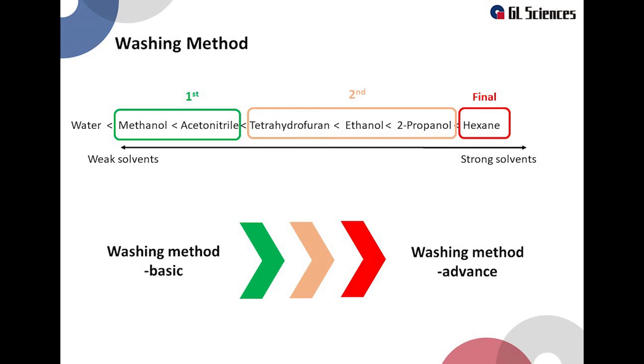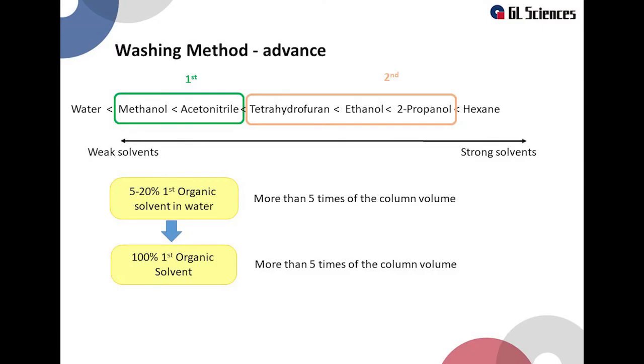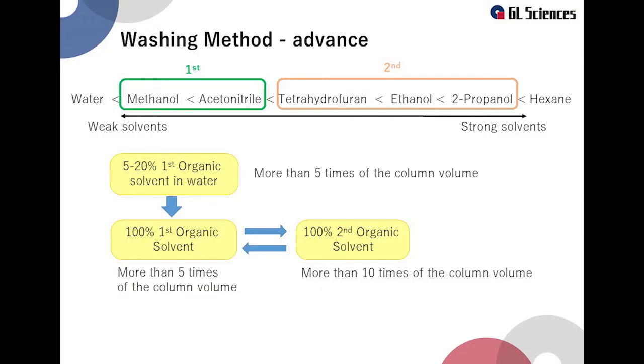If the basic cleaning methods introduced so far do not improve the chromatography, try an advanced washing method using organic solvents of the second choice or final choice. First wash with an organic solvent containing water to prevent salt precipitation. This is similar to the previous method. Fill the column with 100% organic solvent of the first choice and run 5 times the column volume. Then fill it with 100% organic solvent of the second choice and run 10 times the column volume.